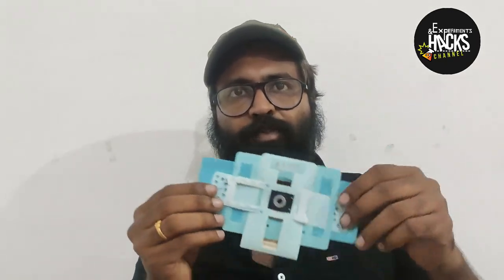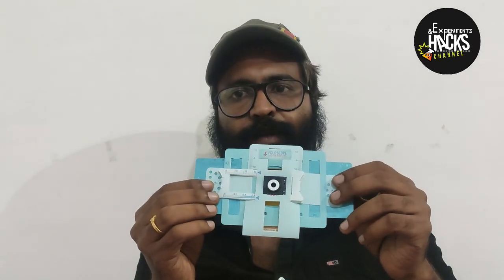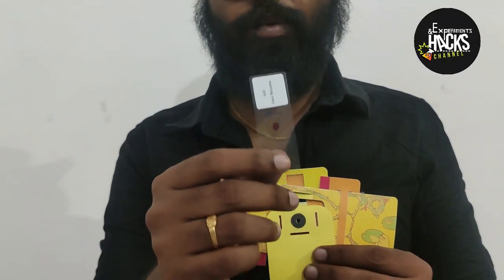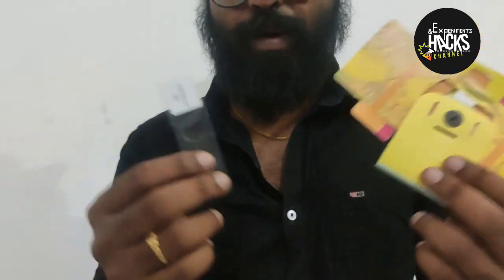The foldscope is a completely functioning microscope — a platform for fluorescent, bright field, polarization, projection, and all kinds of advanced microscopy, built purely by folding paper. You might wonder how that is possible. Assembling this microscope is as simple as playing with a toy ball. The foldscope is specially designed to improve field testing, and you can carry it anywhere just by putting it in your pocket.